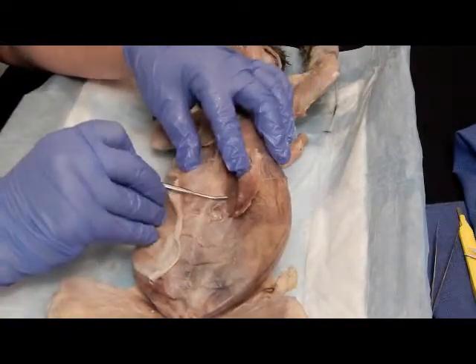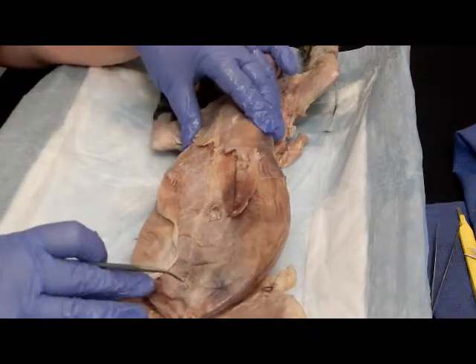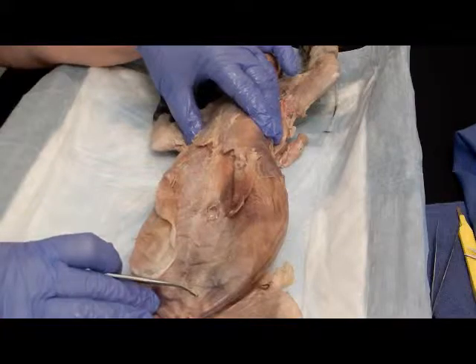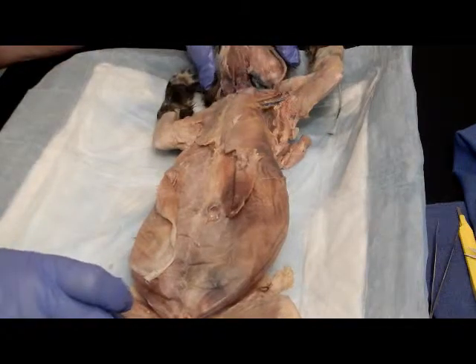The transverse abdominis runs perpendicular to the midline, and its origin is the inguinal ligament, lumbar fascia, cartilages of the last 6 ribs, and the iliac crest. Its insertion is the linea alba and pubic crest, and it compresses abdominal contents.